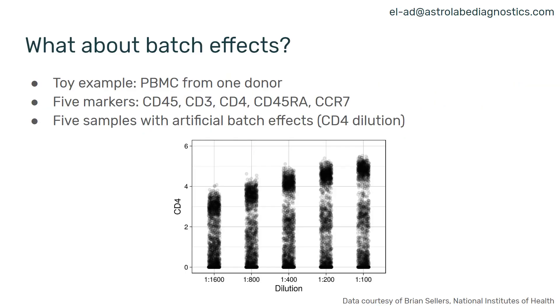As an example, we're using a toy dataset that was acquired by Brian Sellers at the National Institute of Health. We took PBMC from one donor and stained it with just five markers, and we introduced an artificial batch effect by diluting CD4. So we're seeing five samples, five different dilutions of CD4, and in each of these the staining quality of CD4 is pretty good — you can effectively identify the CD4 T-cells — but there is some variation in the intensity of the high peak of the positive cells.